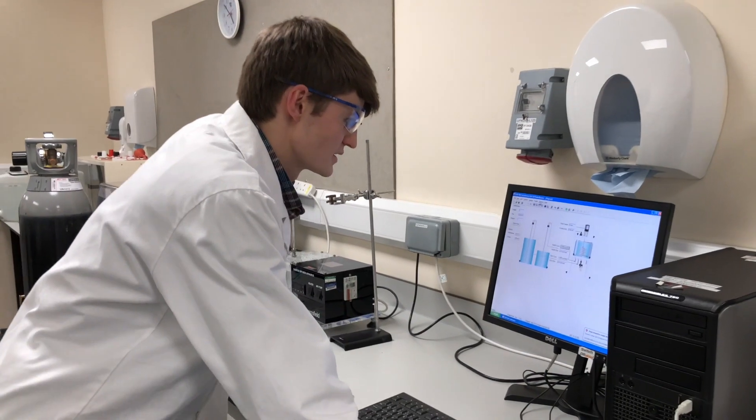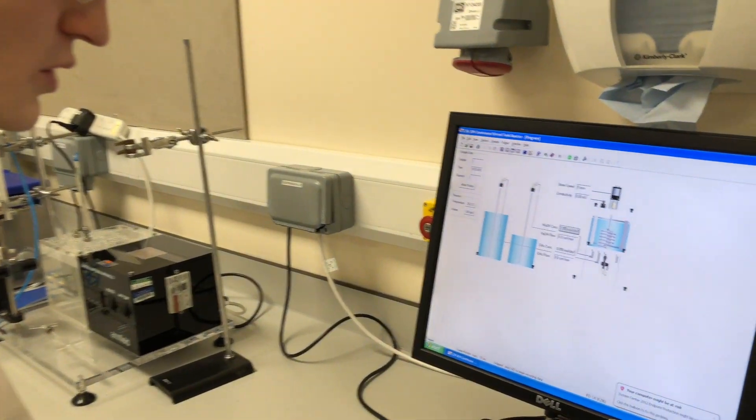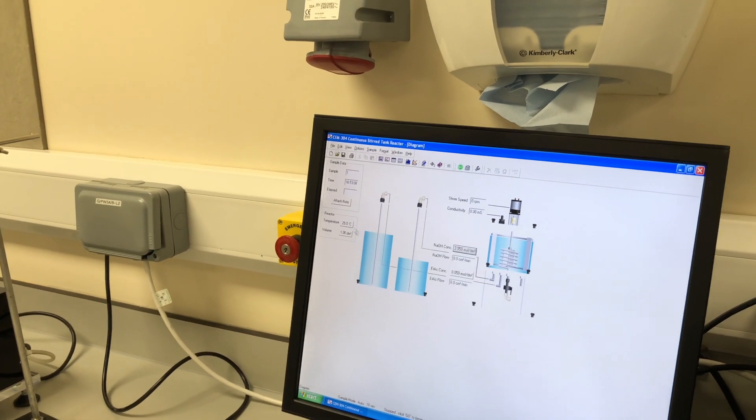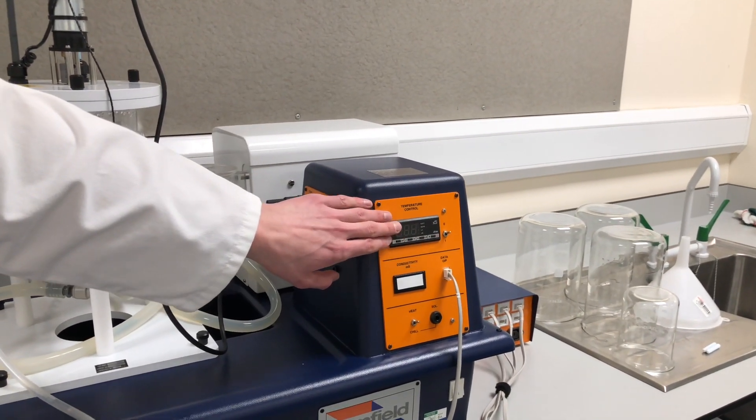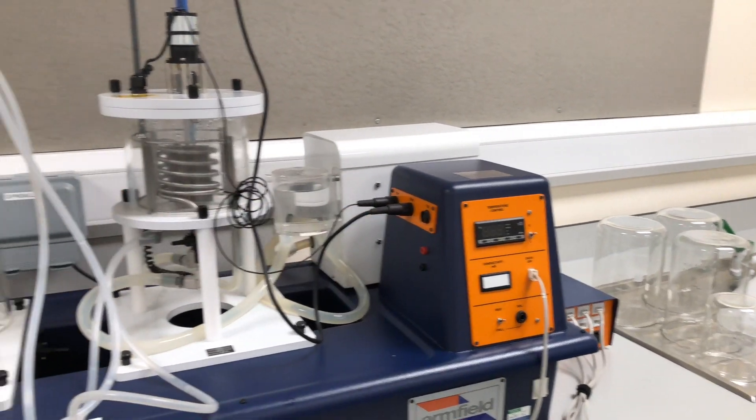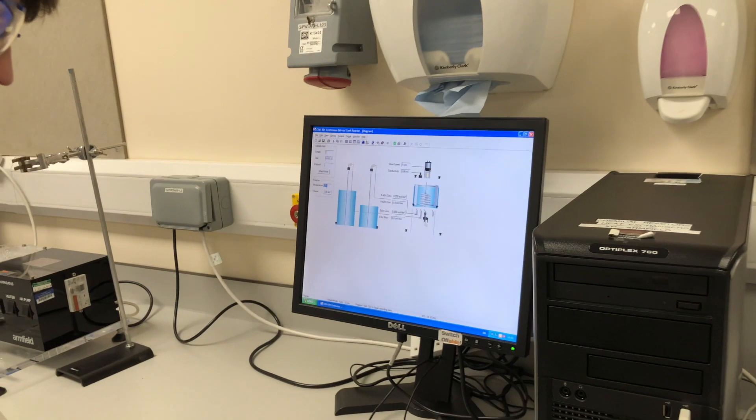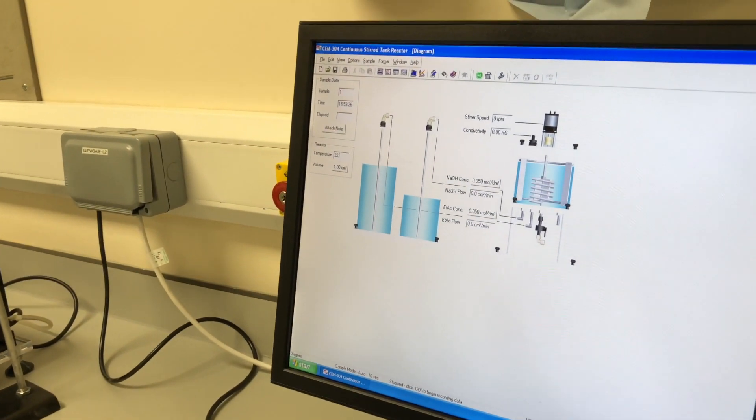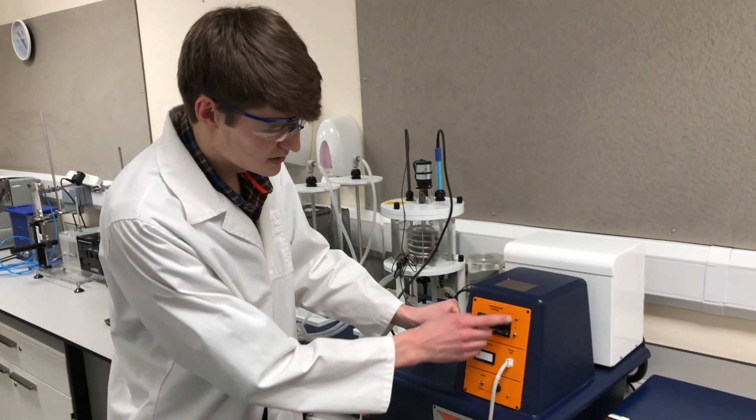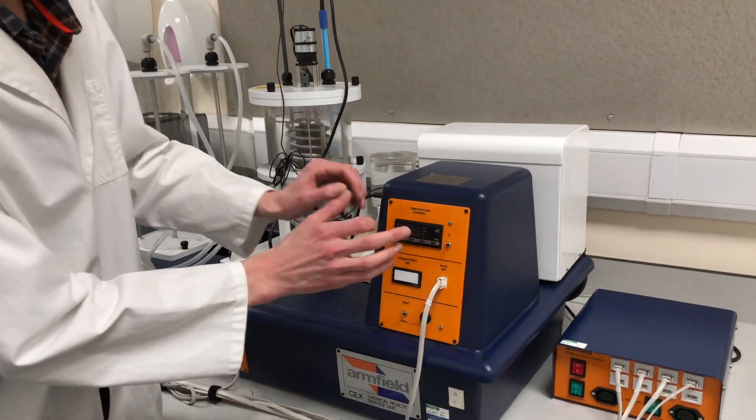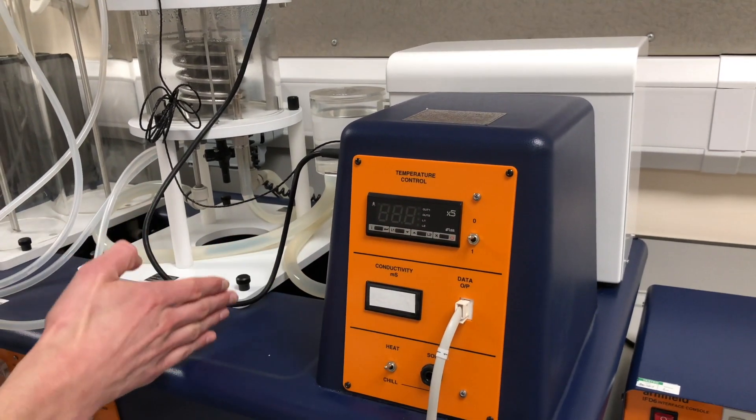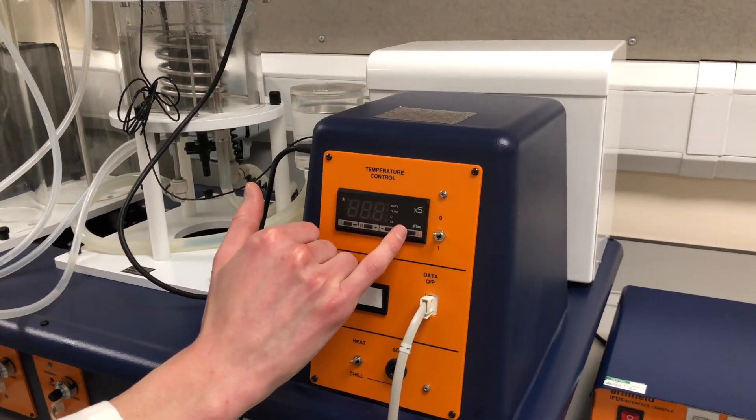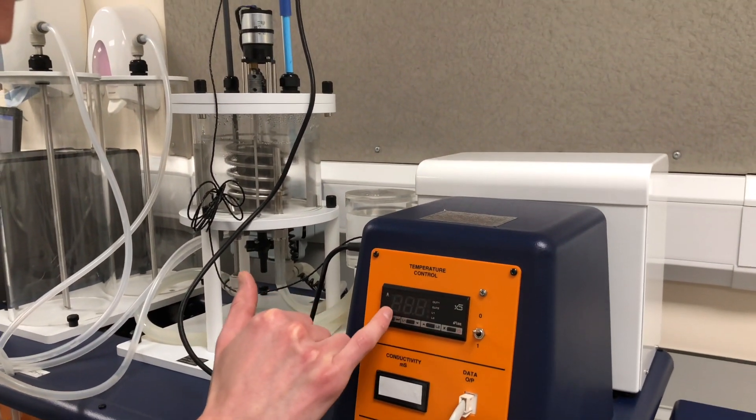Again, similar to the tubular reactor, it's the exact same software. Your three important buttons are just up here. And here, this is where you adjust the temperature. So based on the temperature control unit across here, this here will display the temperature of the solution. And as this changes, even if it goes up by 0.1 degrees, you continuously type in. So again, similarly, if it was 22 degrees, 22.0, and hit enter, and that's it logged. Here, this is the temperature control unit. They're both on the same reactors. And you can adjust the temperature here. You will choose a set point temperature, which will be of set increments of your choice. And once you lock it in, it will begin to heat. And it will display the current temperature there. And that current temperature, you want to make sure you log continuously.